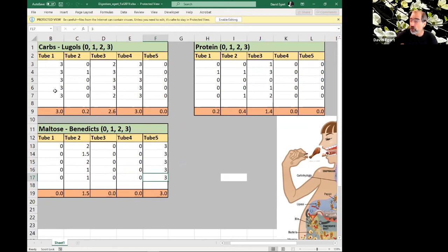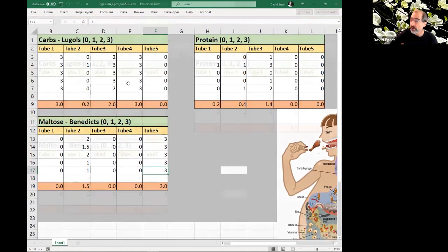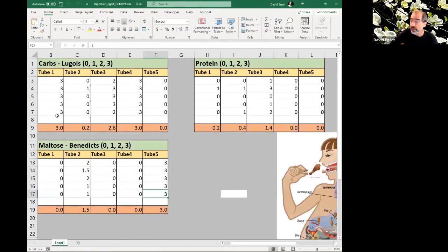And this is just showing across a bunch of different groups, where 3 is like 3 pluses. You want to make sure that everybody's getting the same results, because doing it once is suggestive, but if you do it again and again and keep getting the same result, then you trust it a lot more.